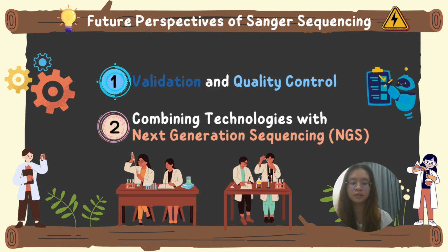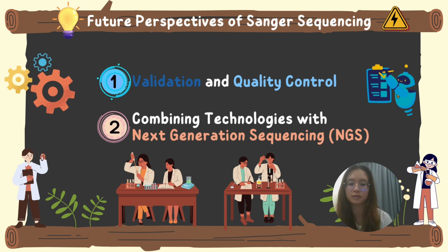Despite the advancement of next generation sequencing technology, Sanger sequencing remains a valuable and important tool in plant genomics. Sanger sequencing serves as the gold standard method for validating and detecting single nucleotide variants or sequences obtained from next generation sequencing platforms. Besides, combining Sanger sequencing and next generation sequencing allows an improvement on their respective strengths. Sanger sequencing is a helpful tool for completing and filling the gaps in next generation sequencing assemblies.